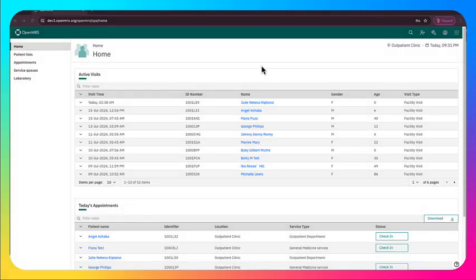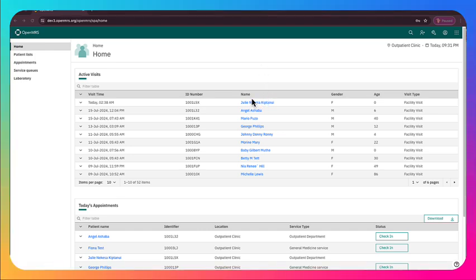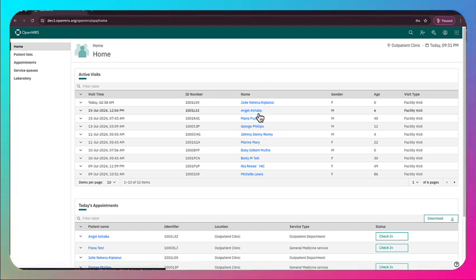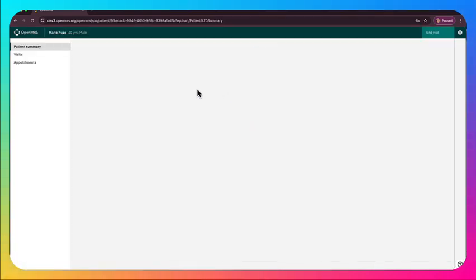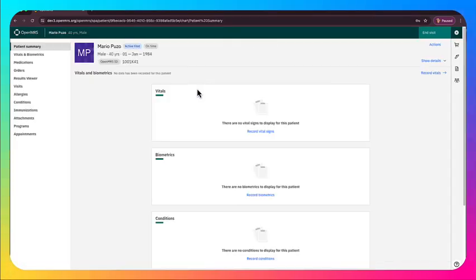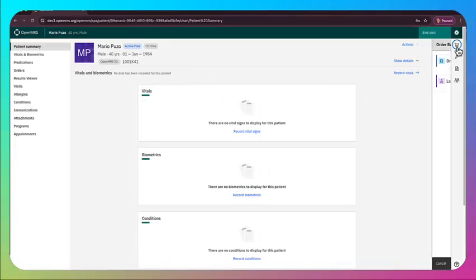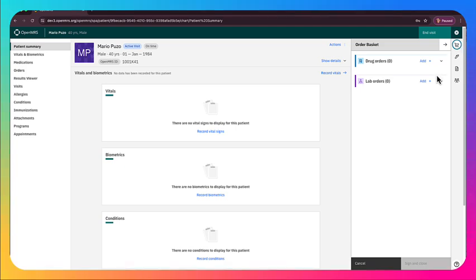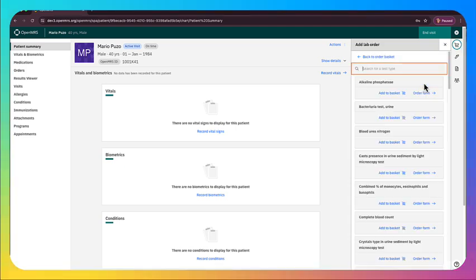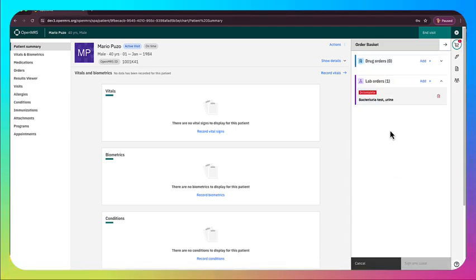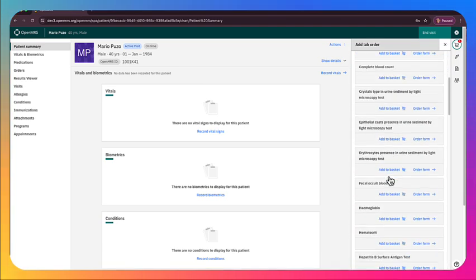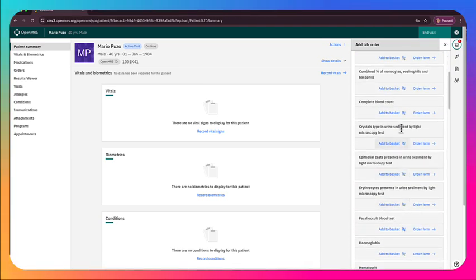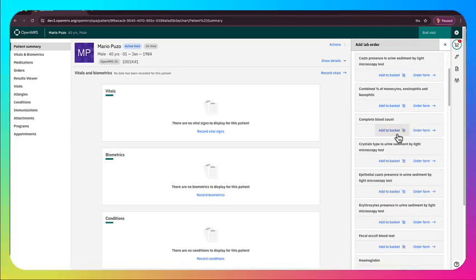All right, let's go ahead and take a look at this new lab work. So here we are in O3, and the first step, of course, is to select a patient. Now that we've got the patient chart app up, we'll go into the lab, add lab order part of the basket, and here we're going to add a couple of different labs.